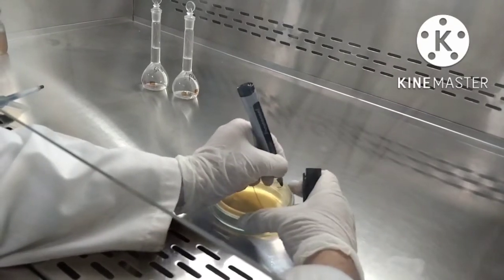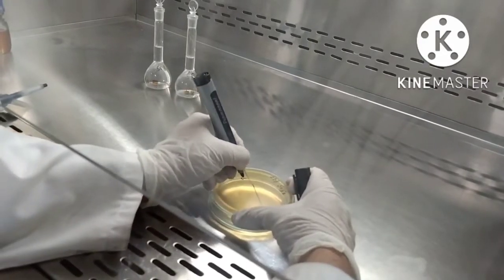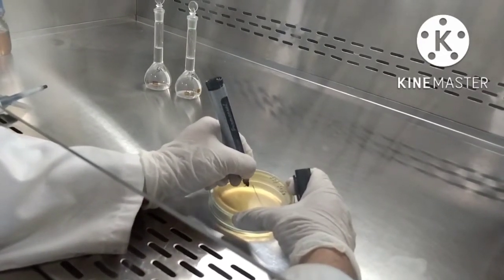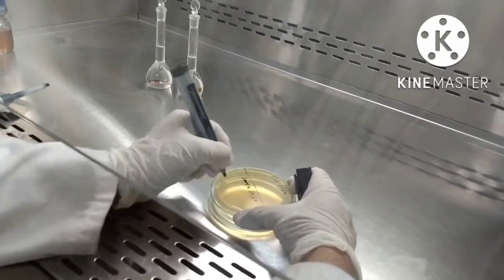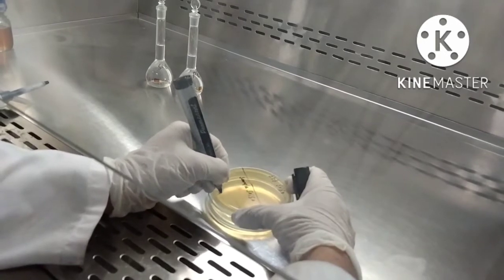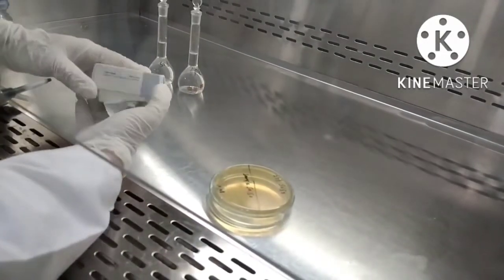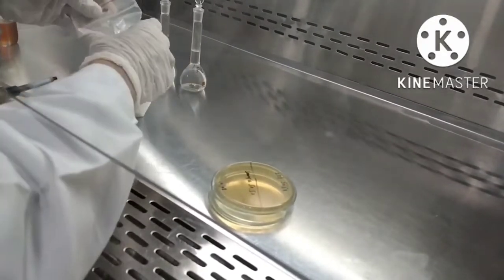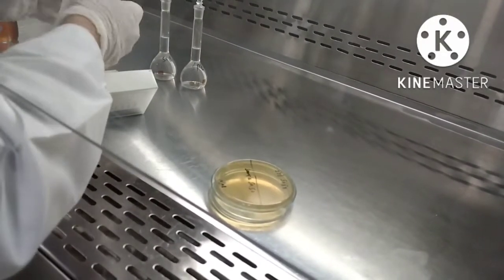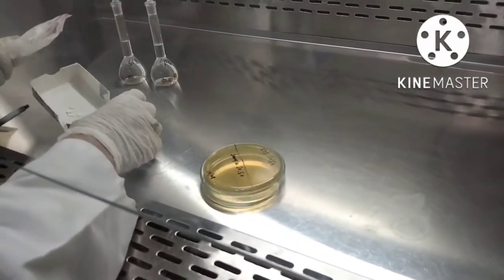One part is for sample and the other for standard. Now add two empty discs in both separated parts.